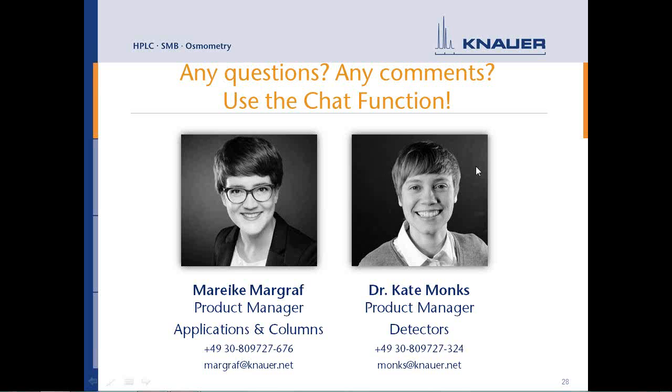Okay, thank you. And we also have another question here. Do you have anything like a flow cell selection guide? Perhaps I can answer that. Obviously, that's what we've tried to do with this presentation here, to give you a bit of a guide to which flow cell is going to be the most appropriate. But we can certainly try to integrate that into our marketing material and into our product selection guides.